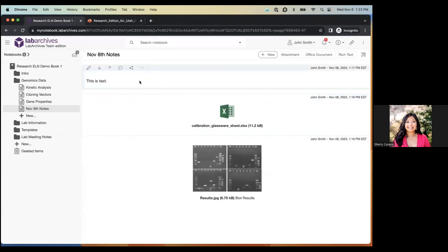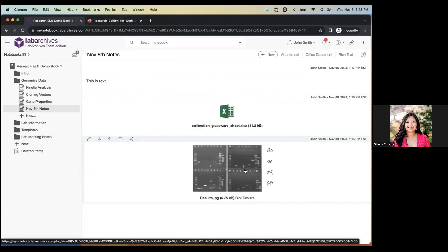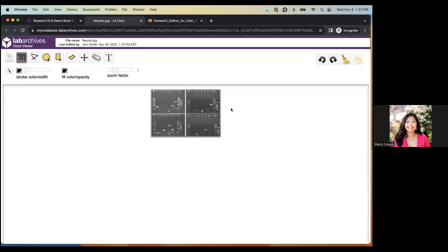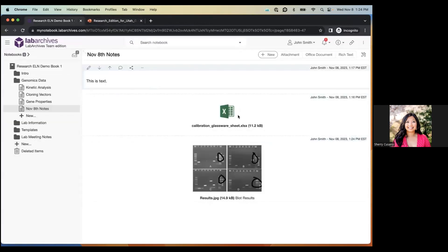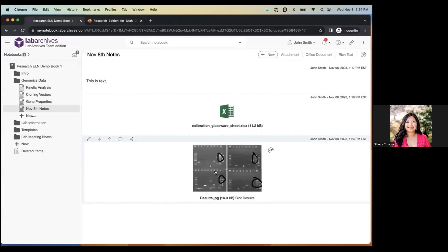Similarly, with images — whether added in a rich text entry or as a standalone attachment — you can annotate images directly through the browser. Just hover over the image and click the 'Annotate' button. It opens in a new tab where you can make all the annotations you need. I'm going to save and make several circles to demonstrate the revision history.